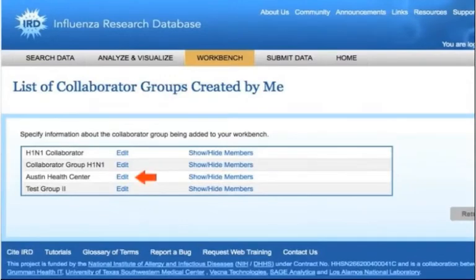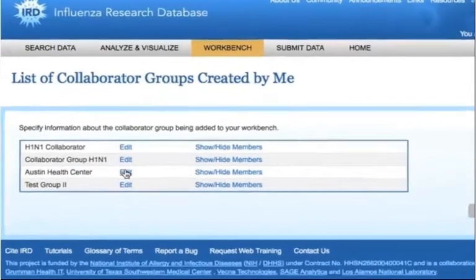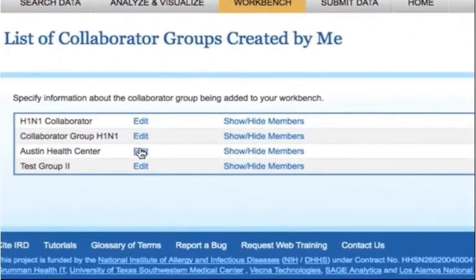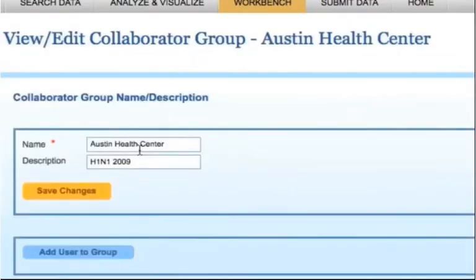Next, select the Edit link next to the group that you would like to modify. The page that is displayed will let you change the name or description of the group by editing the text and clicking the Update button.